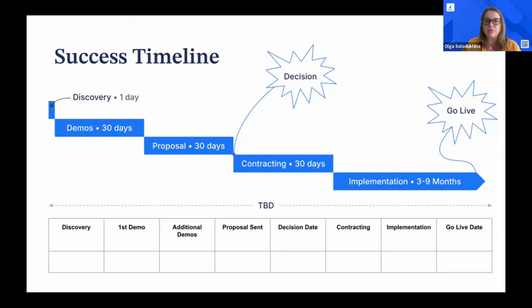Speaking of the solutions, Michael, coming back to the other question. I did talk about LIS and RCM. On top of that, we also have a Test Directly solution, which is a direct-to-consumer module. I would even not call it a module. It's basically a separate platform that can integrate with our LIS as well, if that is needed, or it can be used as a standalone product to solve any direct-to-consumer workflows that you have.